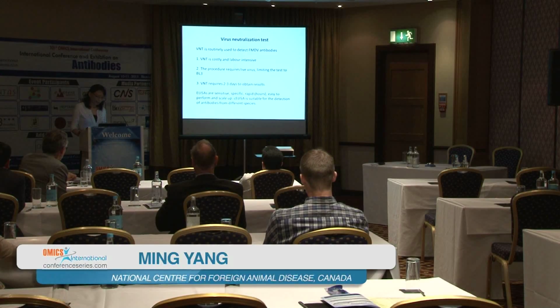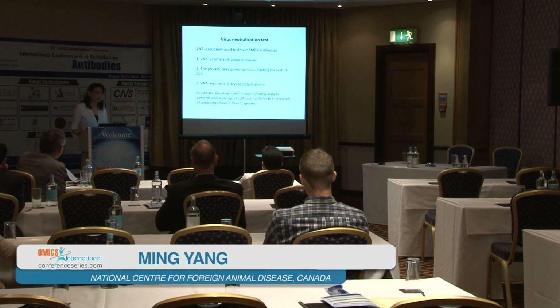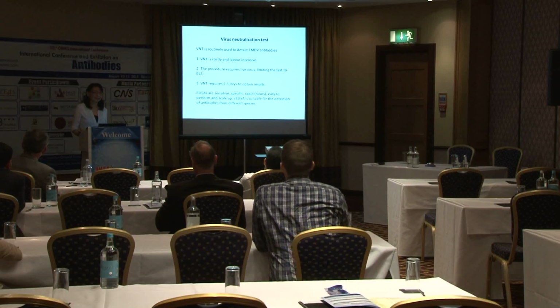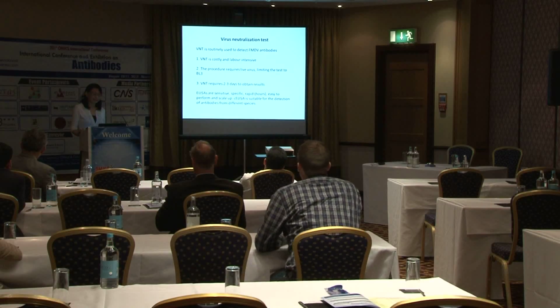In case you are not familiar with biosafety level 3, when we work in level 3, every day we have to totally change our clothes, and when we come out at the end of the day, we have to take a shower and change back to our own clothes. Everything that goes inside level 3 has to be autoclaved when it comes out.